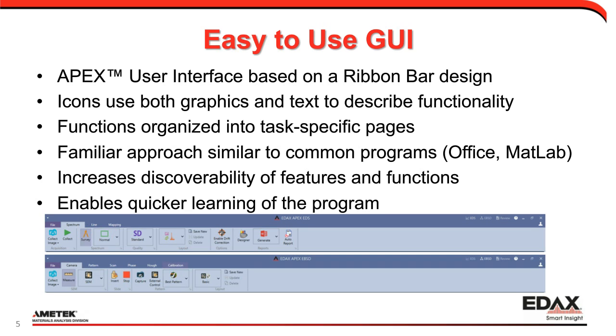So these are just a couple of different images of the EDS and the EBSD application ribbon bars. Again, very similar types of approaches. We've tried to keep them generally consistent, so tasks that are similar in one follow the same type of flow in the other application.